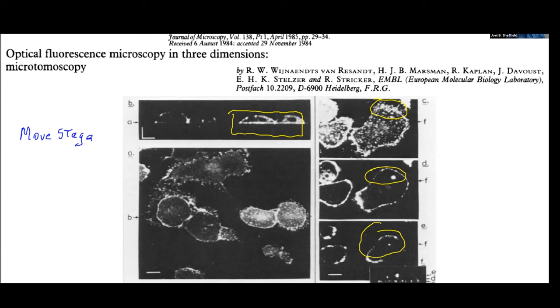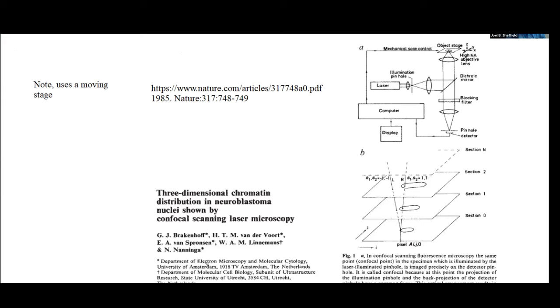And then another set of people, this is the group in Holland, put together another model. There's an interesting story, which is that they wrote this thing up showing that they could do this set of, as you see them here, multiple layers, okay, through a system in which, let's see if we can show how it works. Here's the laser.